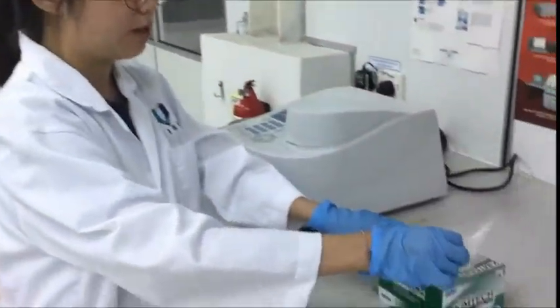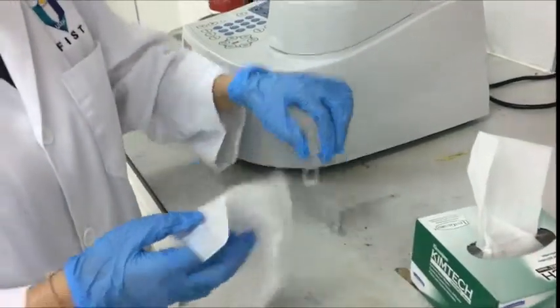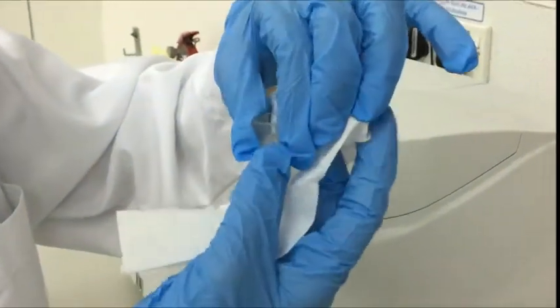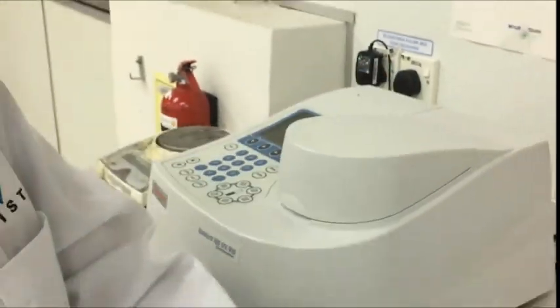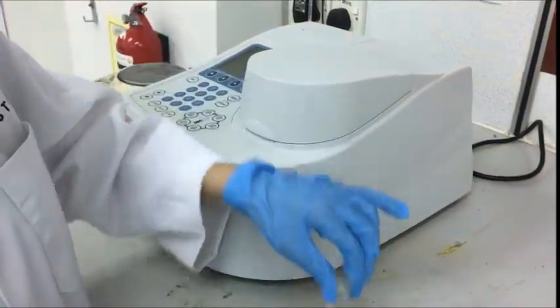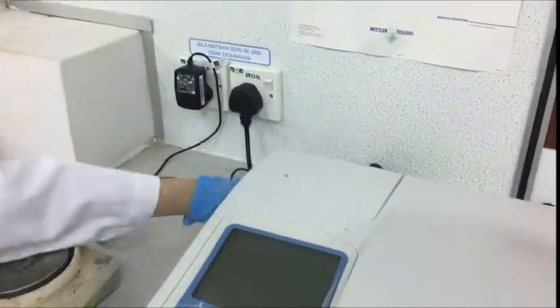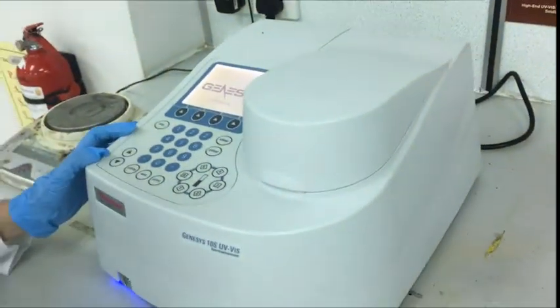For the start of the experiment, I'm going to take out a clean white tissue to wipe off the clear window of the cuvette to prevent contamination and dust. And I will hold the frost window. Then I will power up this UV-Vis by powering it on, and wait for it to warm up for a few minutes.